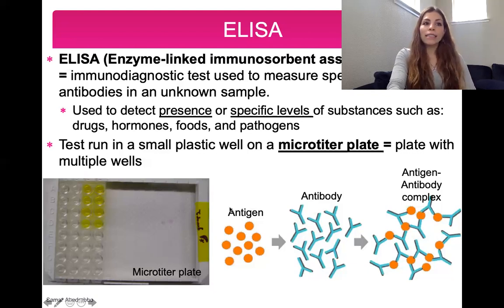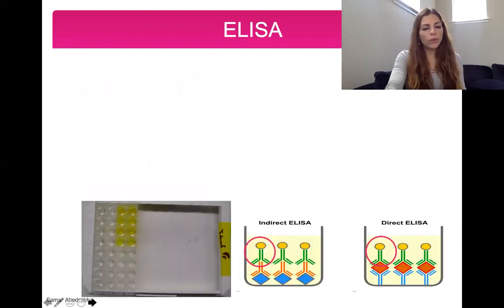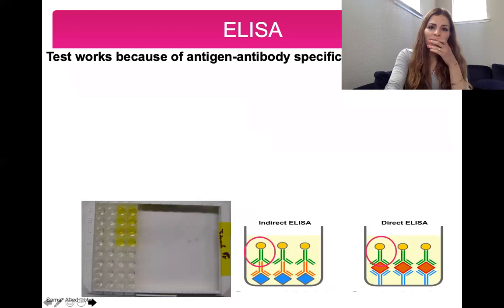In the case of the coronavirus infection, just to make this relevant to you guys, the antigen is actually the coronavirus, the SARS-CoV-2 virus, which is the virus that causes COVID-19, the disease. So that would be the antigen, and hopefully your body would make antibodies to attack the coronavirus. That's the ELISA experiment, and you could do ELISA for many different things.